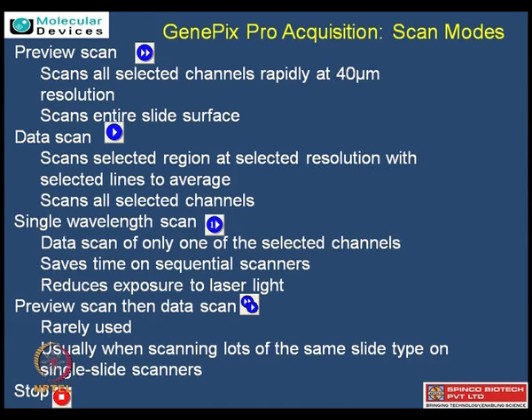So the basic one in the hardware control is, as we said, that we can look at auto PMT and other adjustments which are being done. For that we use preview scan. There are different tabs which allow you to go for the true scan and the preview scan, based on the laser and which particular scan you are using. For example, if you start with the preview scan, you decide which best pixelation suits me, which different power of laser suits me. Once you are able to make these decisions, you can go for your own data scan. People prefer that because there is sometimes a bleaching effect on the fluorophores, so they want to avoid the exposure for a longer time. So multiple scanning is avoided.